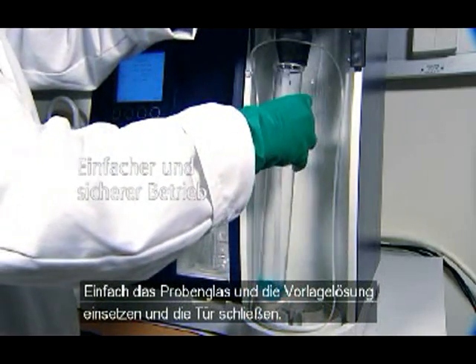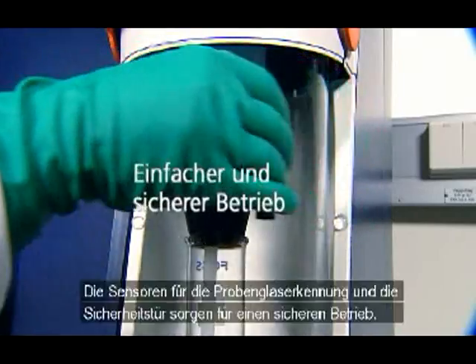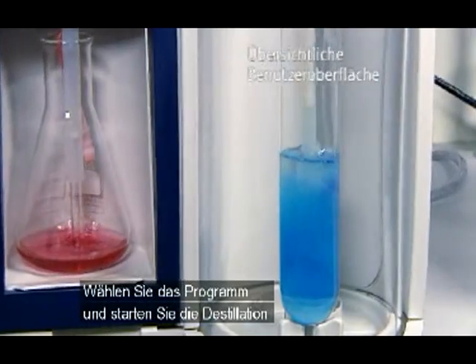Just load your sample tube, place the receiver solution flask and close the door. Sensors for tube in place and the safety door ensure safe operation. Select the program and start the distillation.